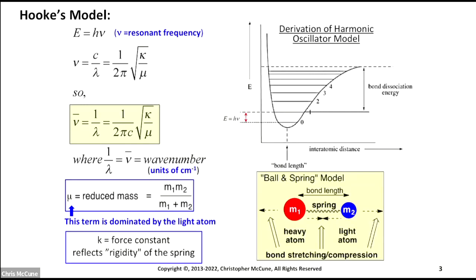And that's why the units are inverse centimeters, because wavelength is a unit of length, typically we're using centimeters. So that's inverse centimeters, where ν bar equals 1 over wavelength. And so there's a relationship between ν bar and frequency now. As you increase the frequency, ν bar gets higher.